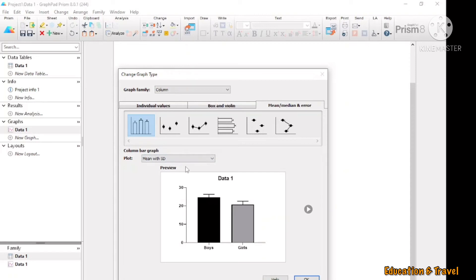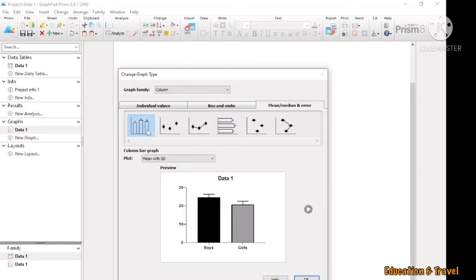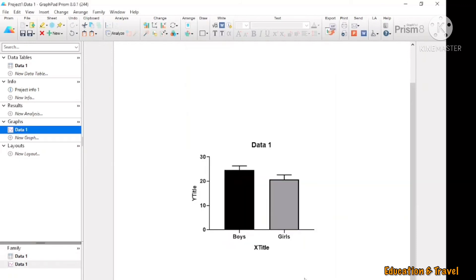Then you have to choose which type of bar chart you want to use — this one or this one. I want to use this one, so then click OK. Now you have your chart very easily.